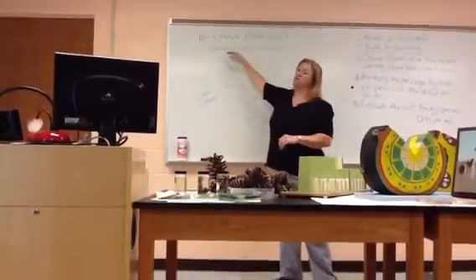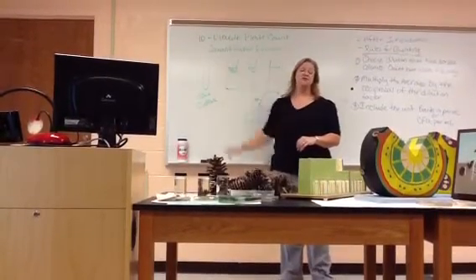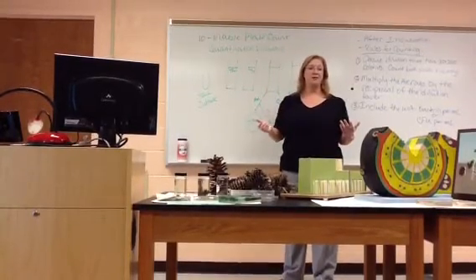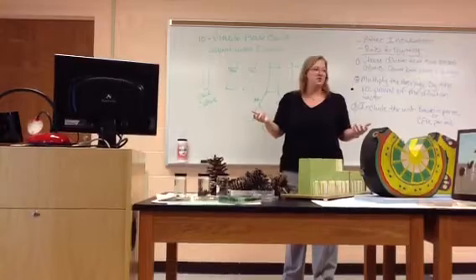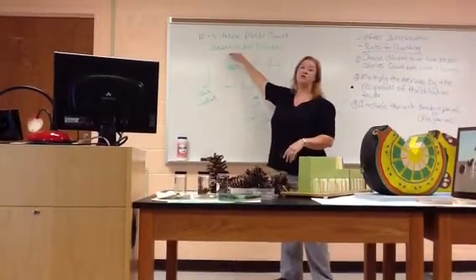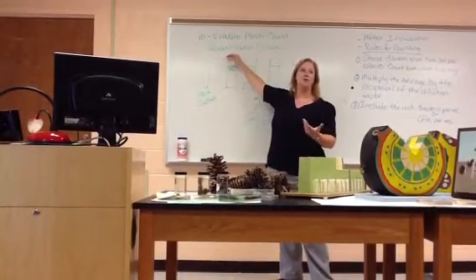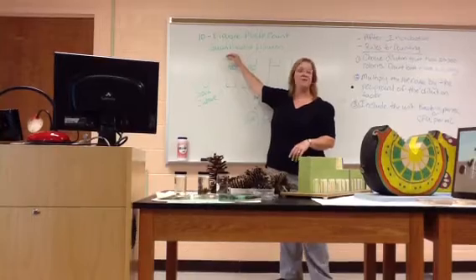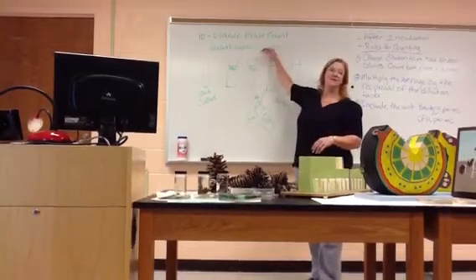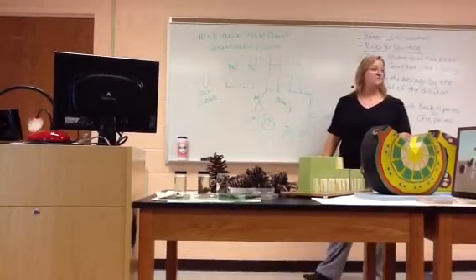But this time we're going to be doing quantitative dilutions. In Lab 9, with those pour plates in front of you, you used the loop to move the bacteria. You didn't know how many bacteria you were moving. How many are on a loopful? Right? It depends on how big your loop is. This time we're going to be a little more scientific about it. We're going to measure the volume of bacteria that we're moving. So quantitative dilution, we're measuring the amount of liquid we're using to make the dilution. And dilution is still a reduction in concentration.